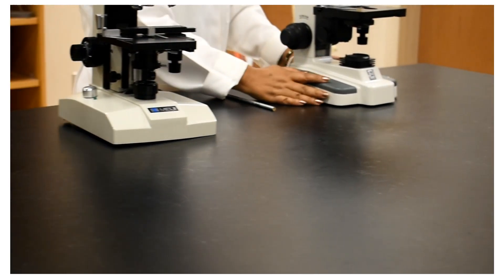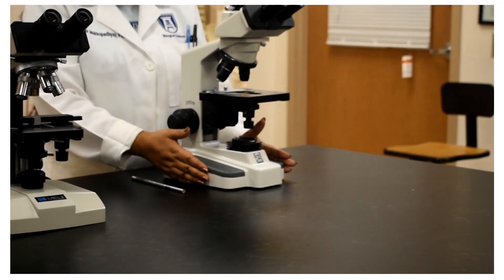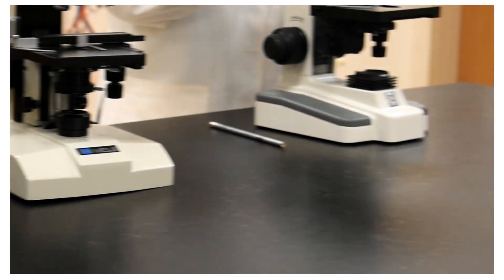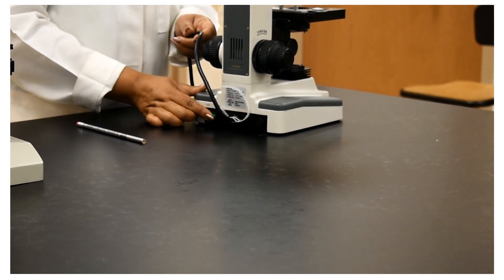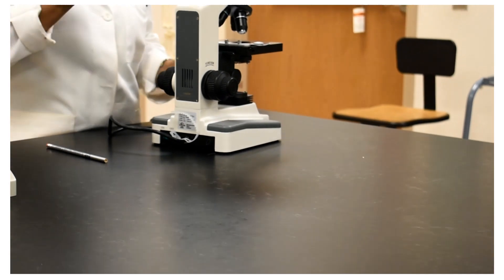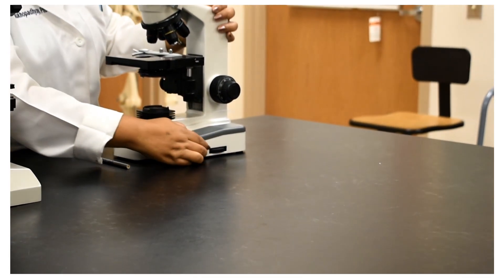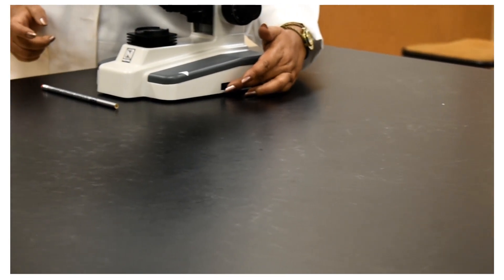The other one I have here is from a different company, National. The size of its base is kind of in between the other two we looked at before. For this microscope, the light switch is at the very back of the microscope. The brightness control will be on your right side when you are looking at the ocular lens — on the right side of the base, there is the brightness control knob.